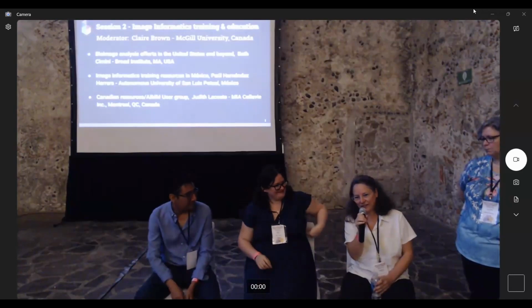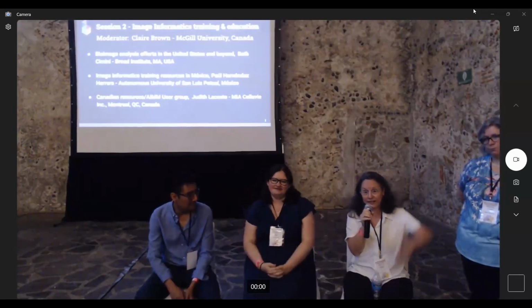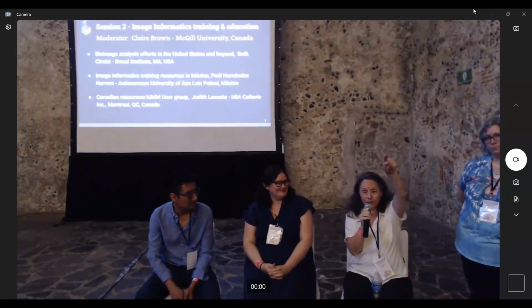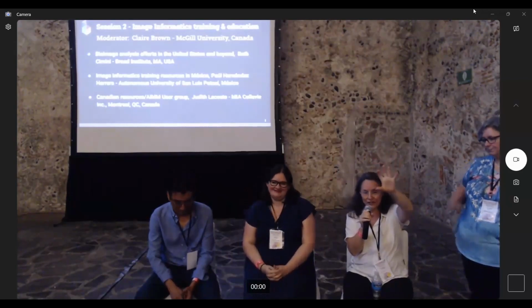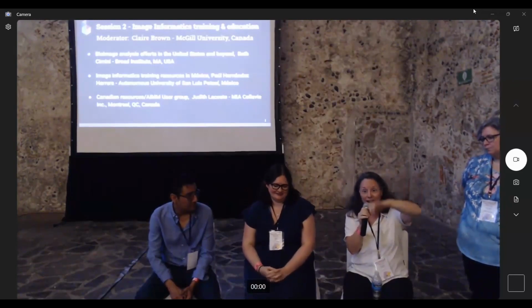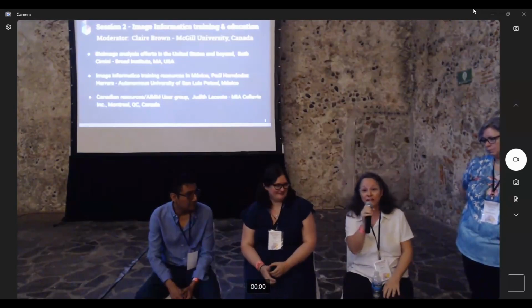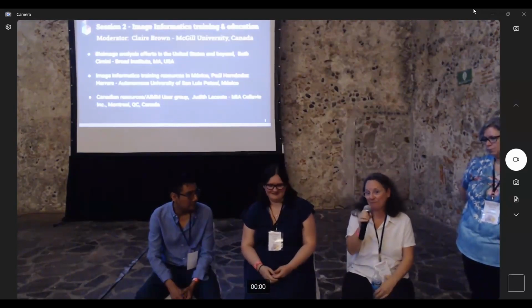I would say if you take the habit of using research data management and start at point 0 on top and consider your experimental design and try to go through your whole cycle before actually getting on the microscope and preparing the sample, you're going to save a lot of time down the road.